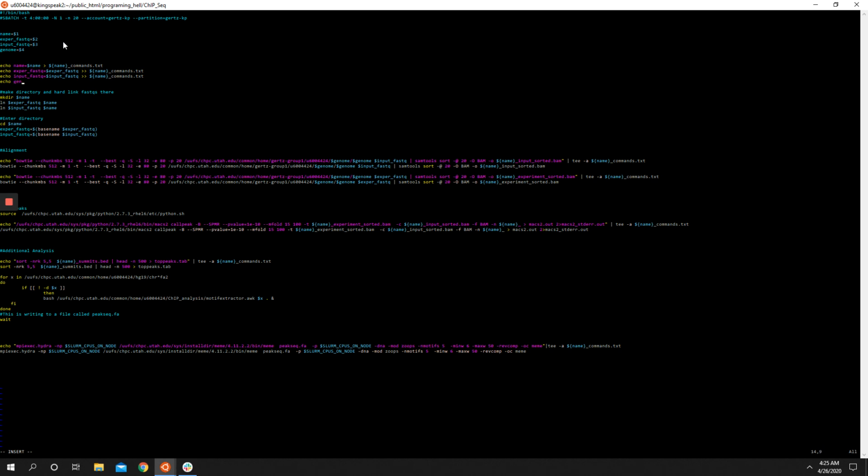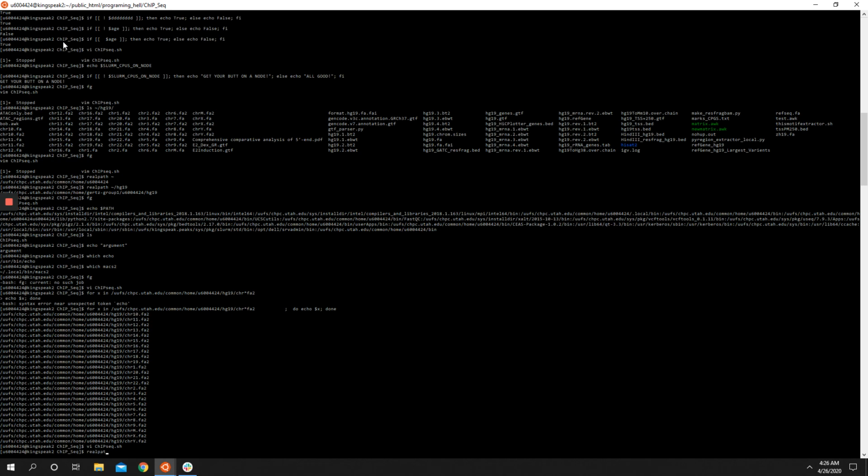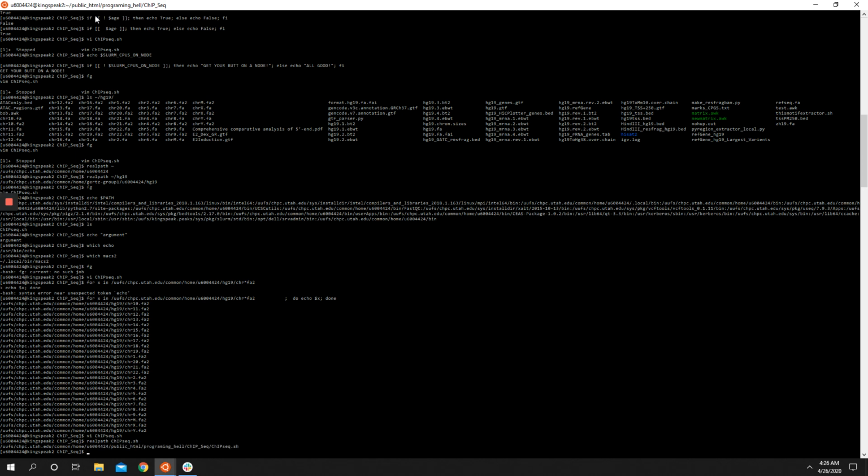Almost there. IPGM equals $sign genome out to that thing. Okay, so that should tell us pretty much everything that happened. I'm not going to run this now. You can go ahead and try and run it yourself if you wanted to. The path to it is here. You can try and run it and see if it runs as expected.